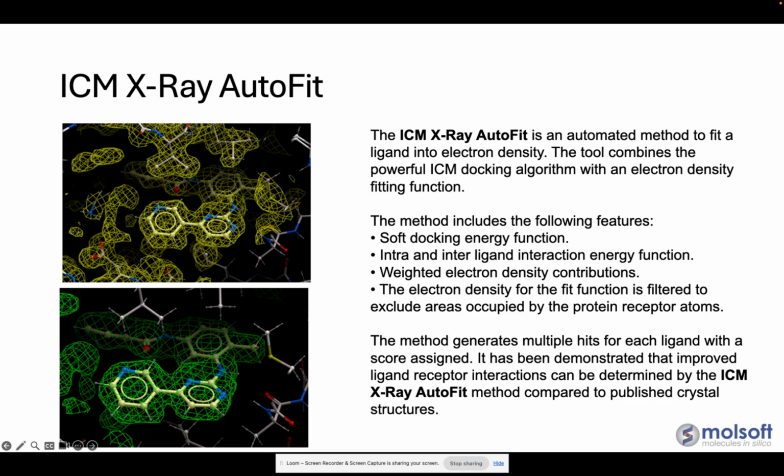There's also an intra and inter-ligand interaction energy function. The method considers both the internal strain of the ligand and how it interacts with surrounding residues in the binding site. This ensures that the final pose not only fits the density, but is also chemically reasonable and energetically favorable.